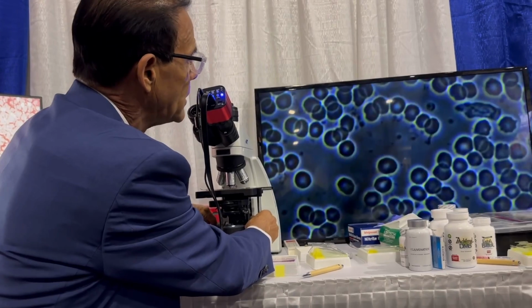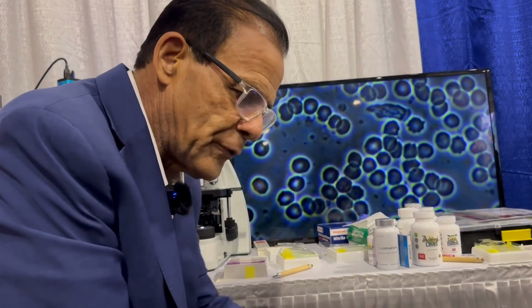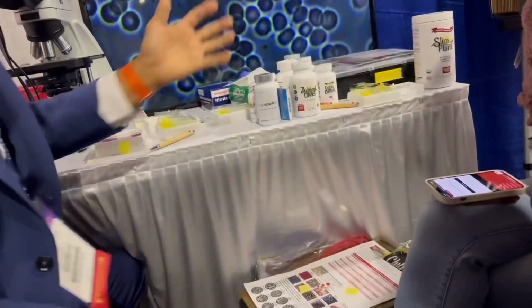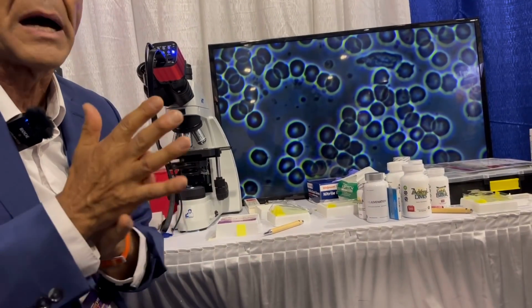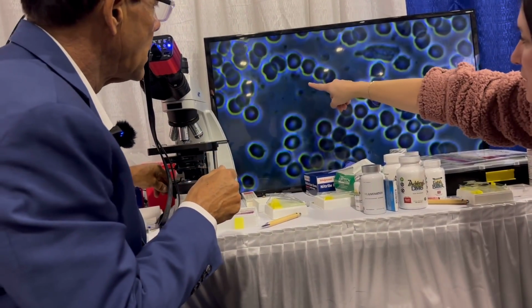There's another one. And that, look in the, yeah. So if you look right here, that is a neutrophil. You see that right there? Yeah. And it's very active. That's good. It's moving that way. You see how it's pseudopod? It's looking for viruses and bacteria to clean up the body and the blood. Now, here are all those, that little one that's moving right there.